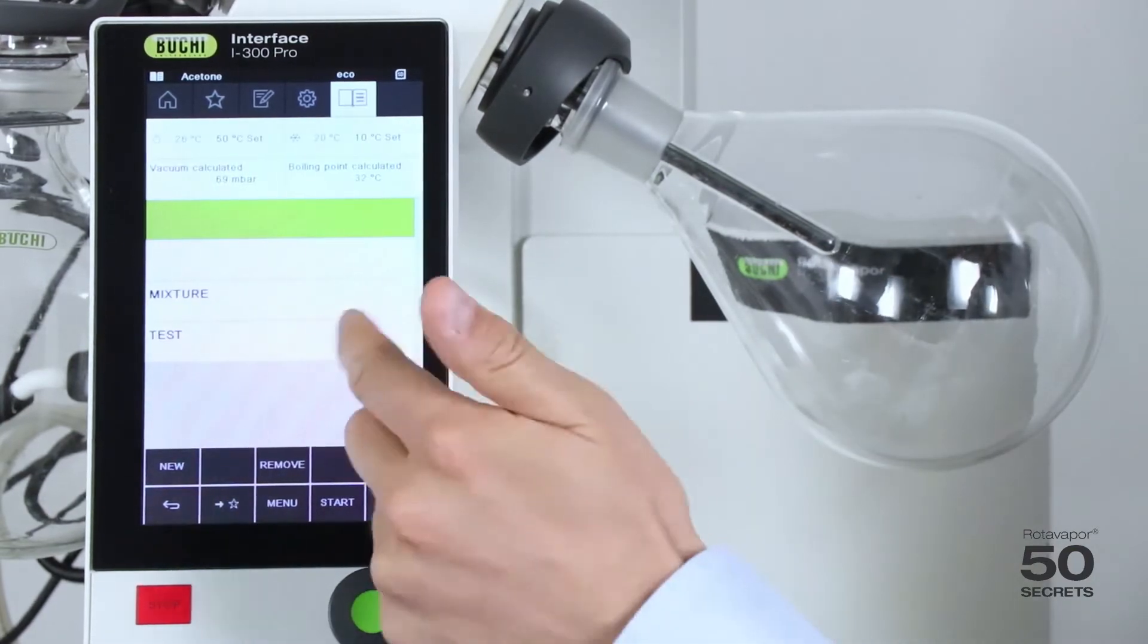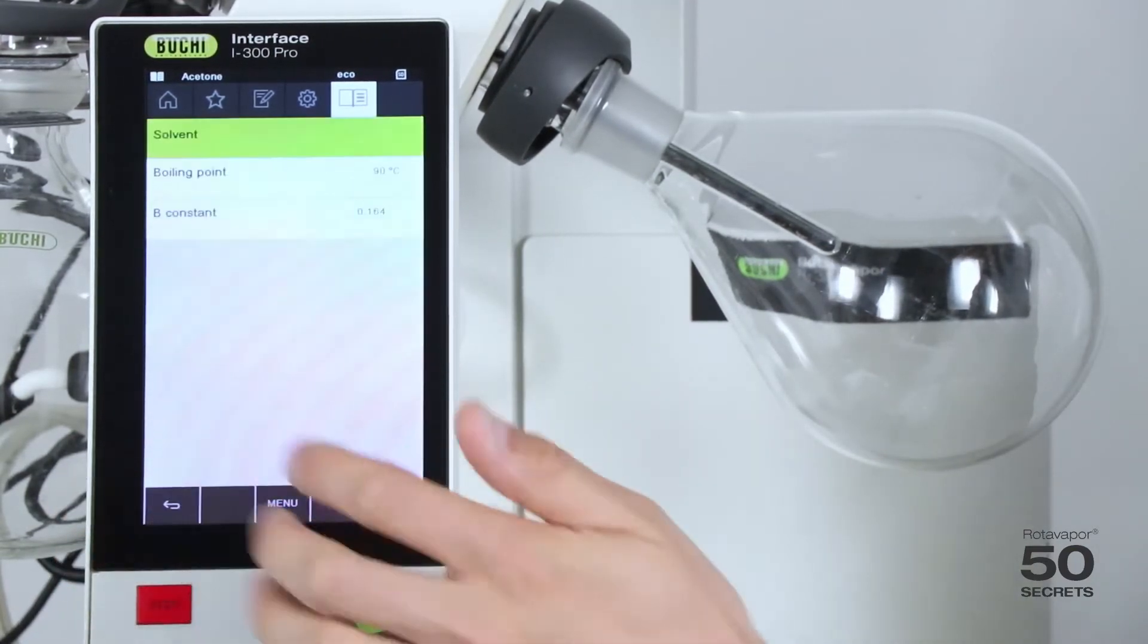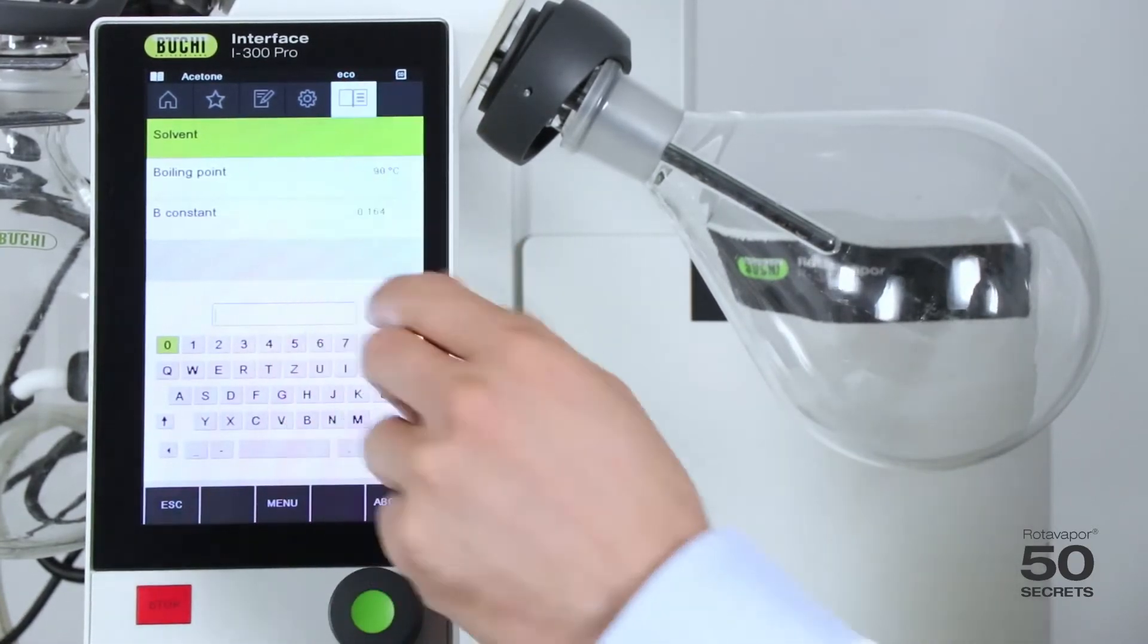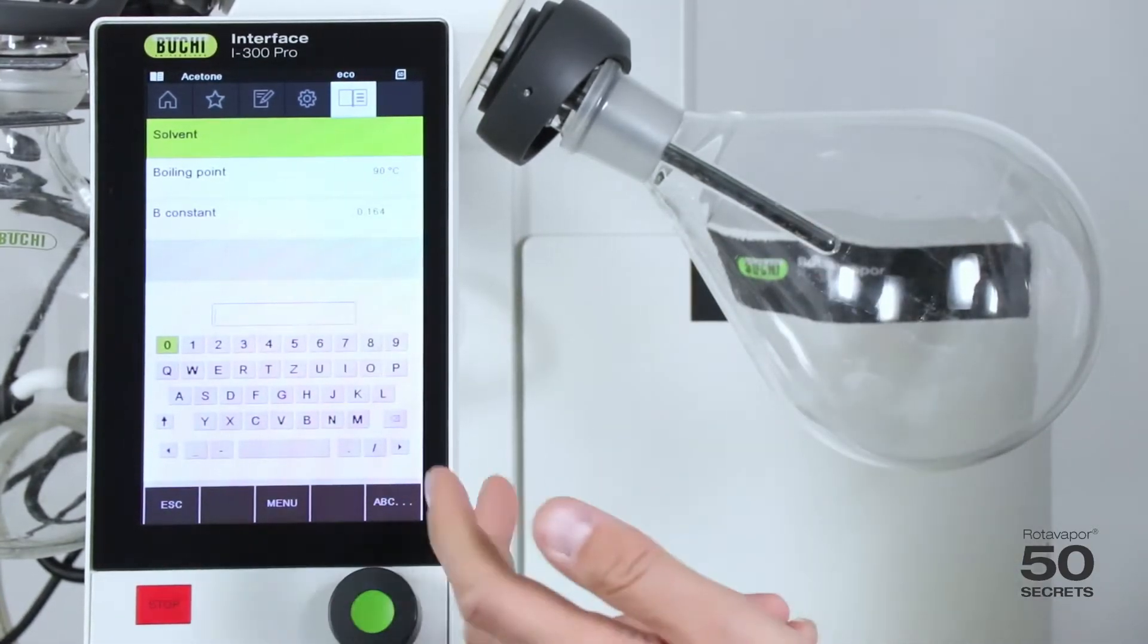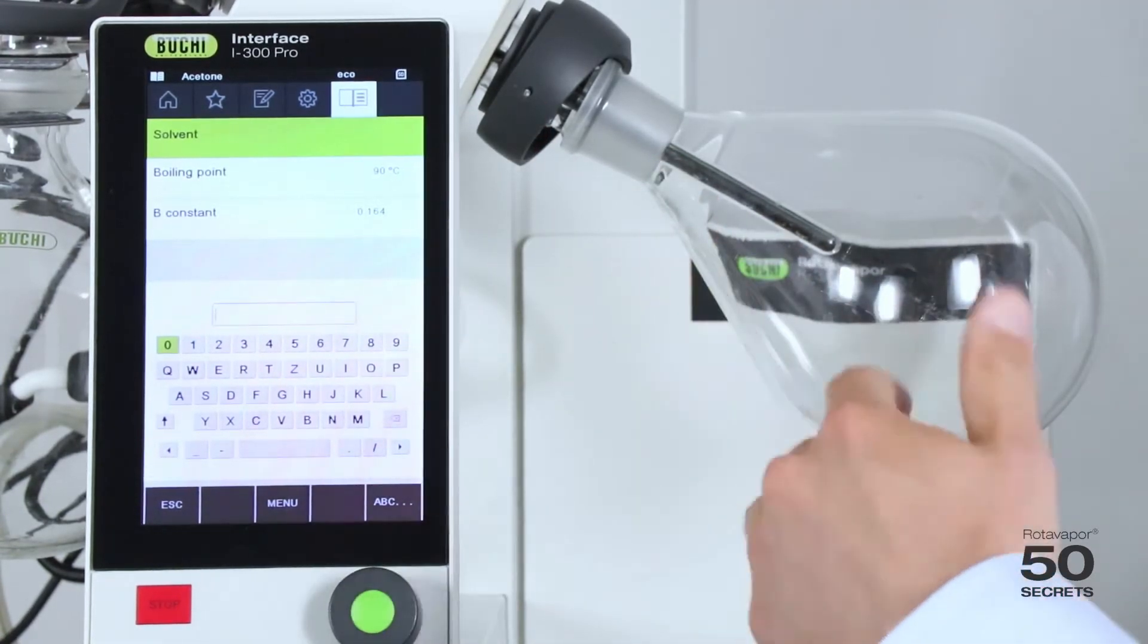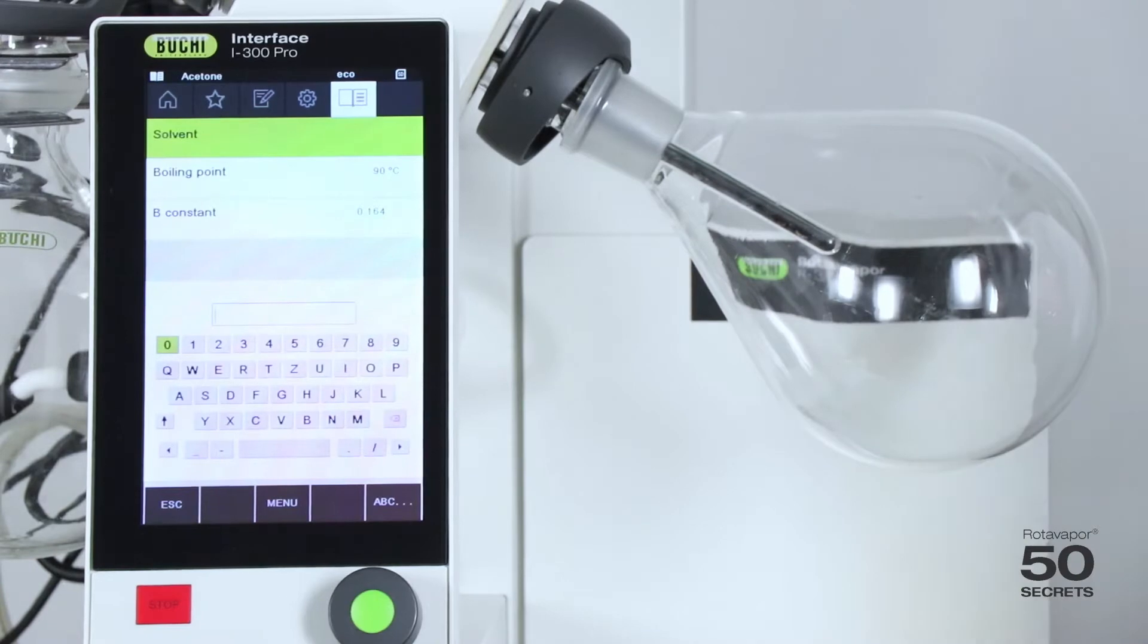By doing that you can create your own solvent. You can select a name for your solvent, a boiling point, and a b constant which you find in literature. So by doing that you can easily just add your own solvents to the system.